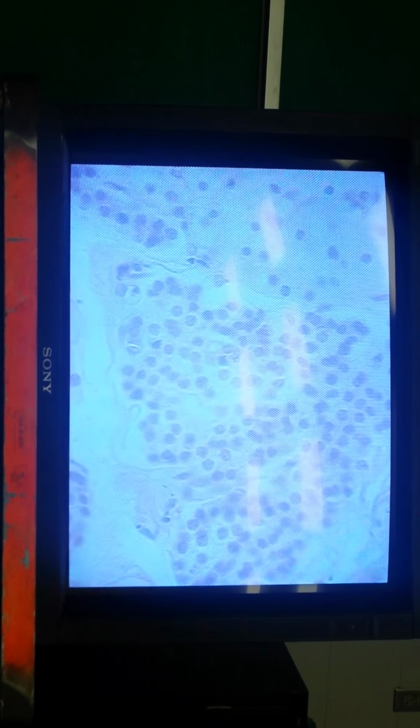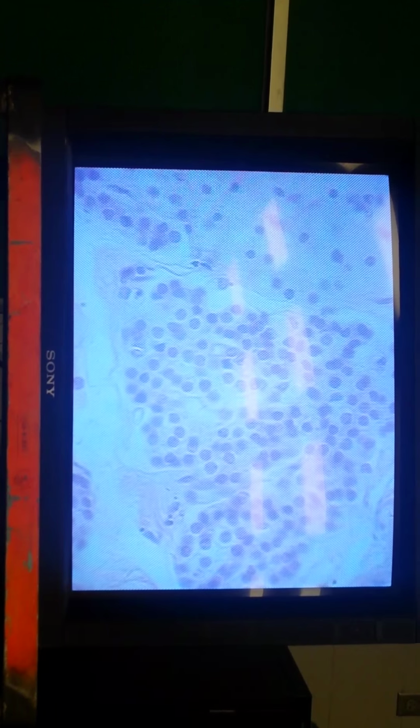This one most likely could be mistaken for thymus at lower magnification. Most of the slides you'll know what gland you're in. This one probably I will let you know what gland you're in. But ask you what kind of cell is this, or what kind of cell is that, what hormone does it secrete? So, parathyroid. Okay. There's an overview of a parathyroid.